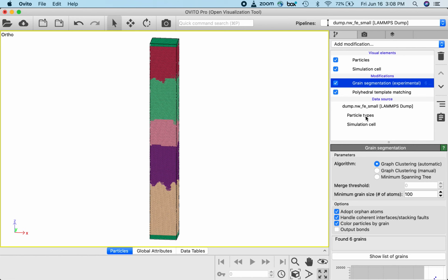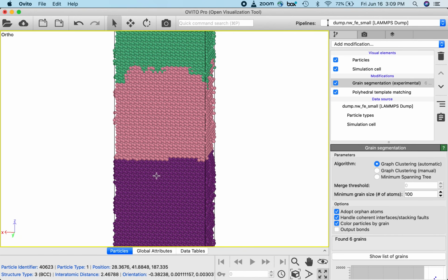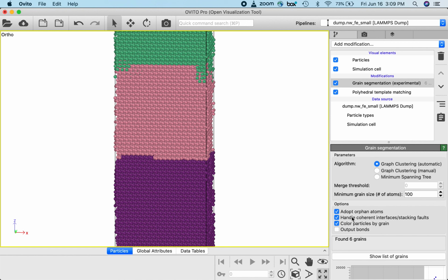So you need to first be careful and make sure that your system is correctly identifying grains, or at least correctly enough, so that the main point we're interested in here is that right near the interface, on either side of the interface, we've identified distinct crystals. Because the way ILDA works, it considers an interface between a set of crystals as identified by GSA here. So we've got to make sure that the entire interface is spanned by a single pair of crystals, and we can see that that is in fact the case. So we're ready to go on to the next step.